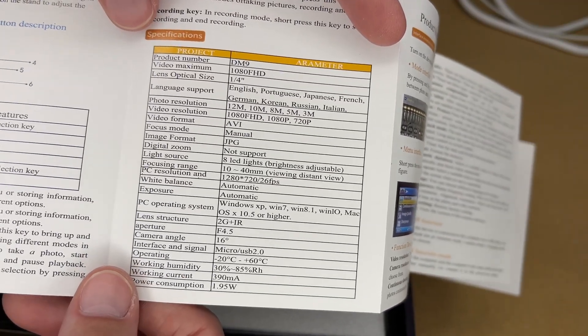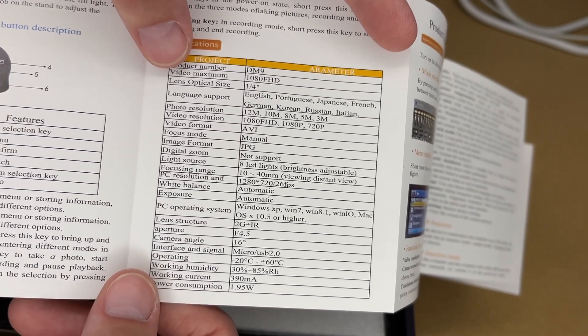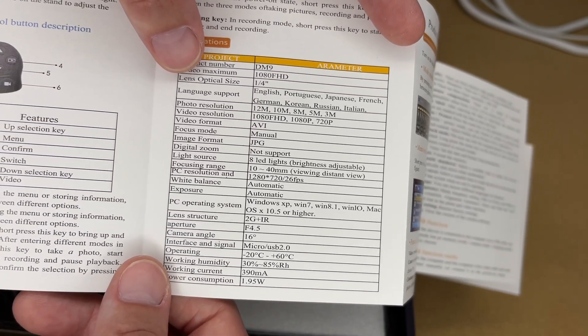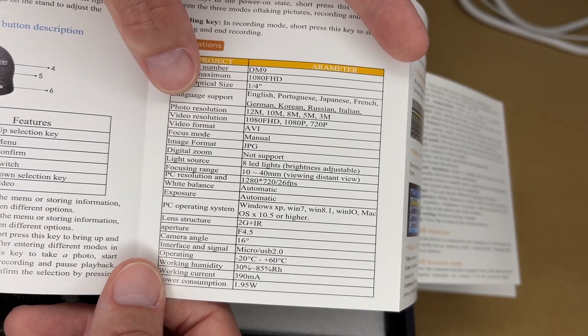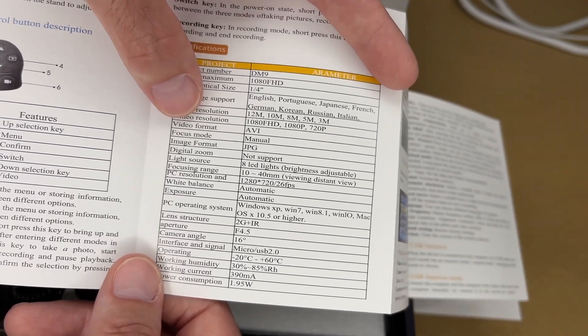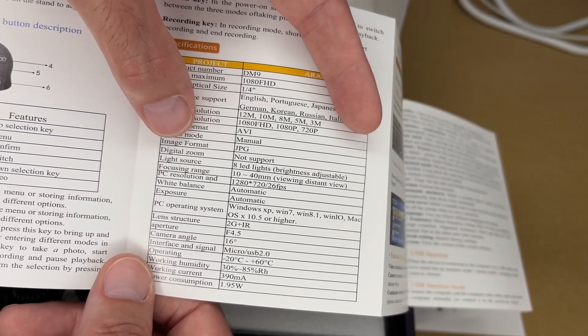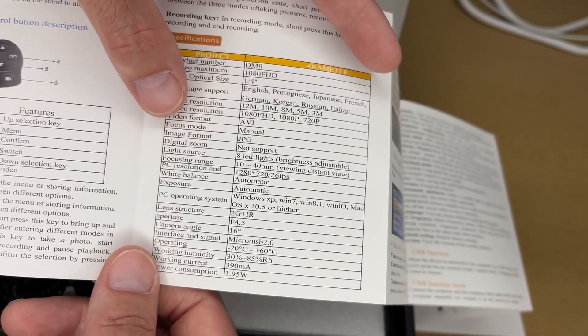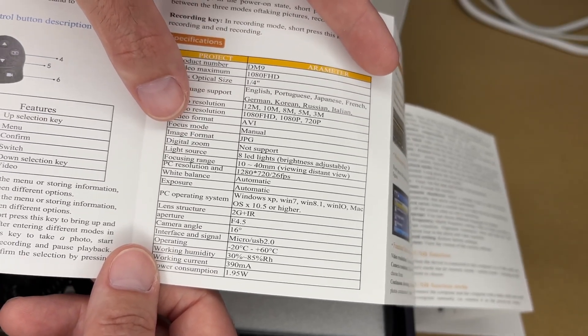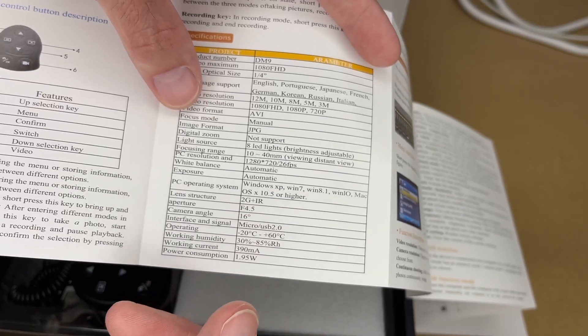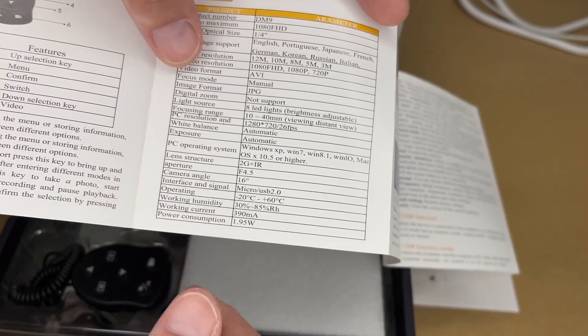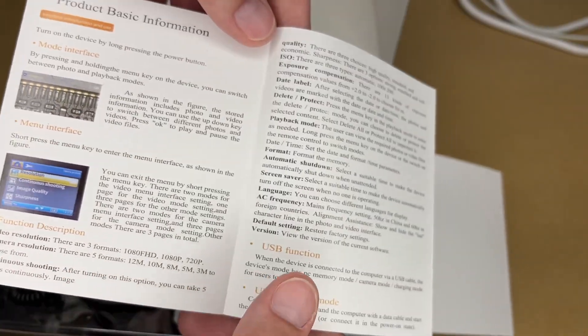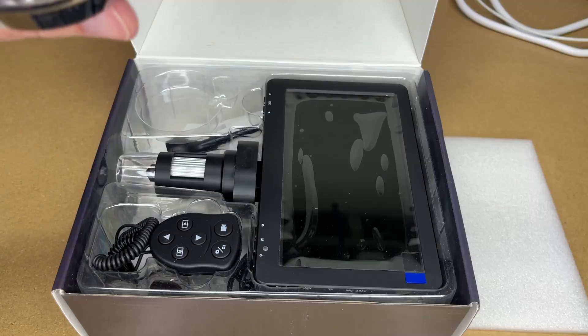Here are some specs. I'll go through a couple of these. Maximum video is 1080p FHD. Lens optical size is quarter inch. Photo resolution is 12, 10, 8, 5 and 3 megapixels. Video format is AVI. Focus mode is manual. Image format is JPEG. PC resolution is 1280 by 720 at 26 FPS. This works with Windows or Mac. Power consumption is 1.95 watts. So these are the different menus and modes.